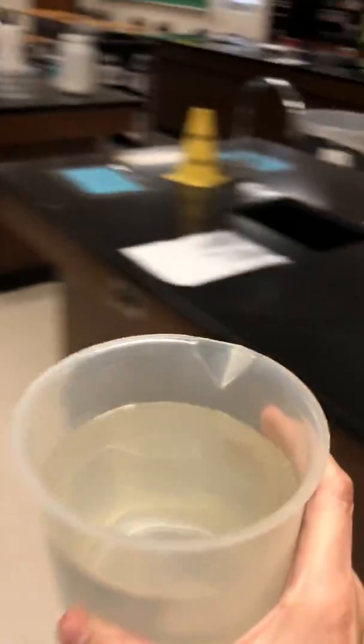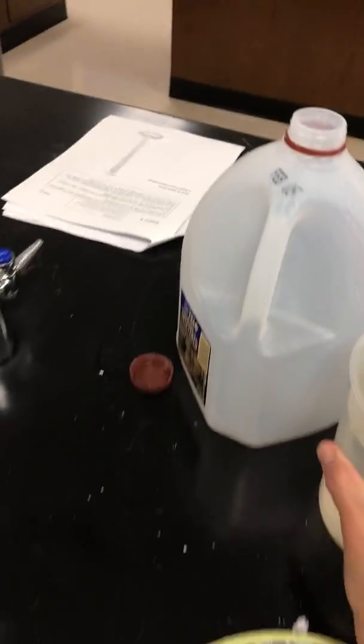One minute should do it. I need cold water. I think I left some. Yeah, there we go. That's cold. It said to get 40 mils of cold water.